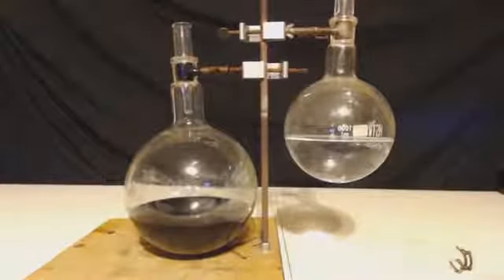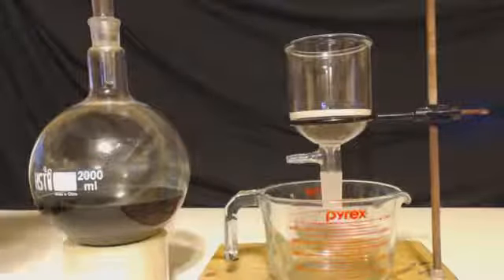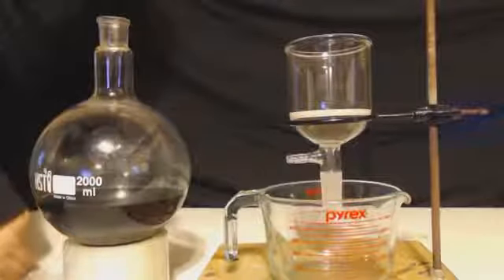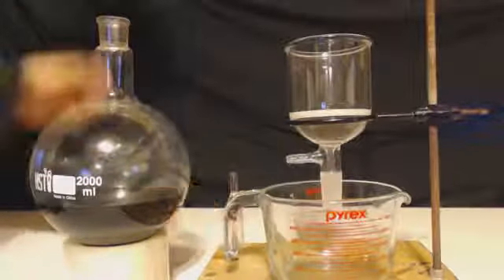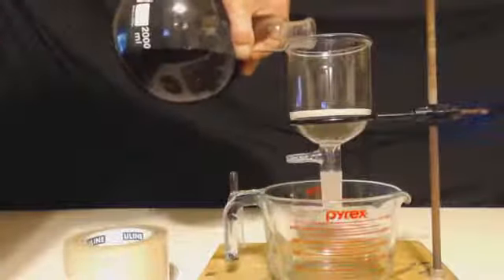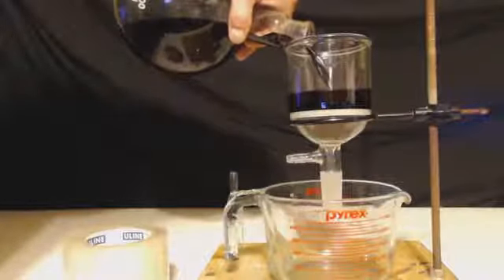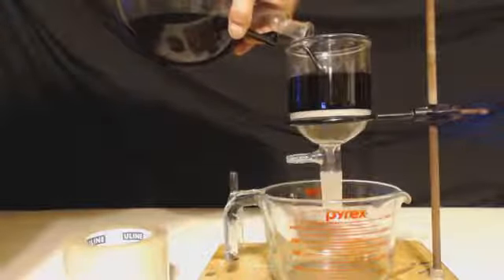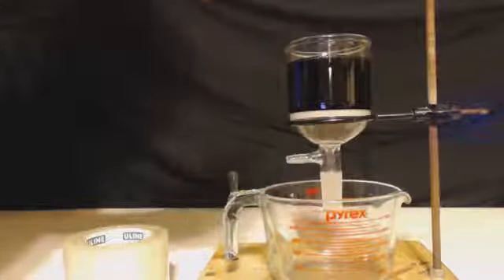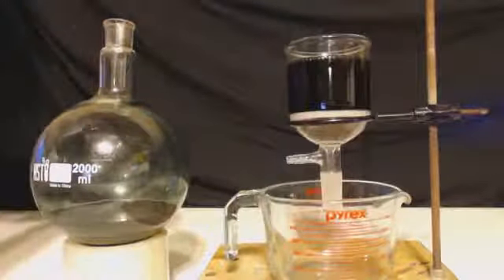Now when I get done with this, I distilled it, so it heated it up and made it really react. So there's not that much metal left in it, but I want to filter it anyway, because there is some in there. And you'll see after I filter it, a light layer at the bottom of the funnel. The stir bar and the boiling chips just look like they're on top of it. They don't look like they're in it, you know what I mean? So it's a real thin layer. And what I'll do is collect that out, and that dilute HCl that I distilled, I will throw that little bit of metal powder into there and just let it sit for months or weeks or whenever I do it again.